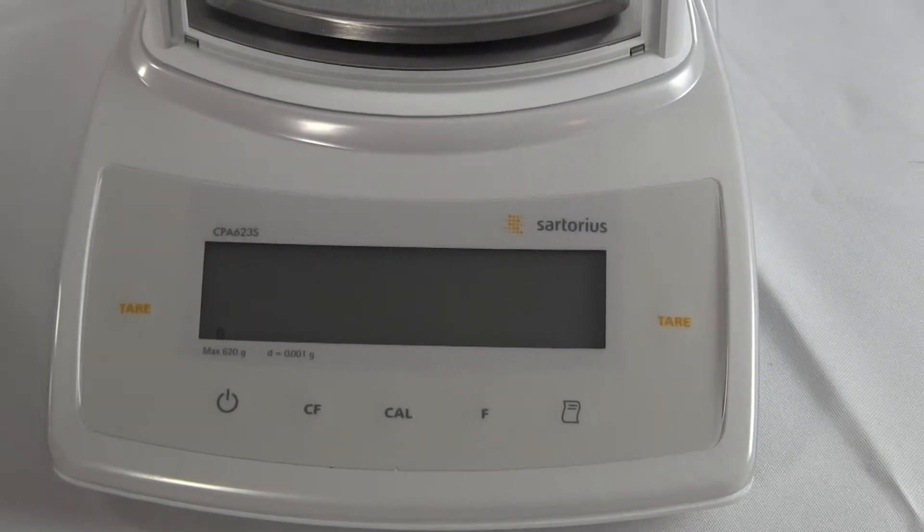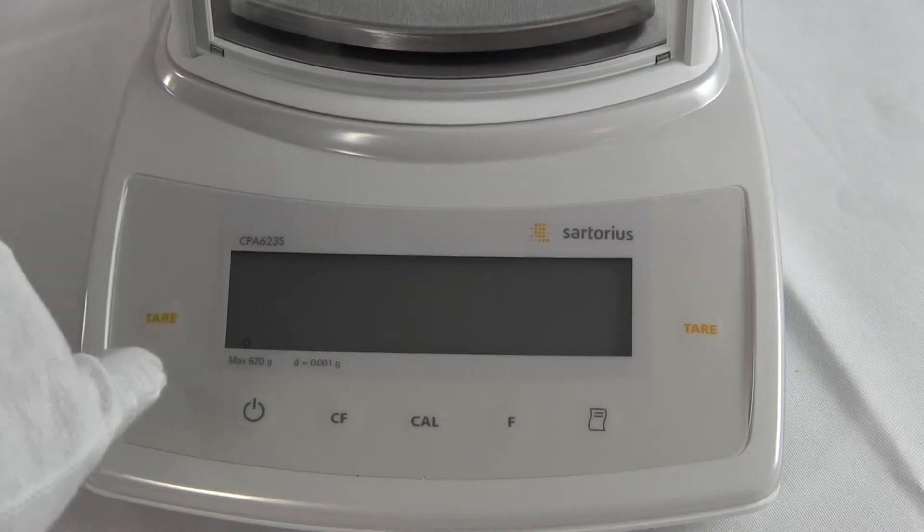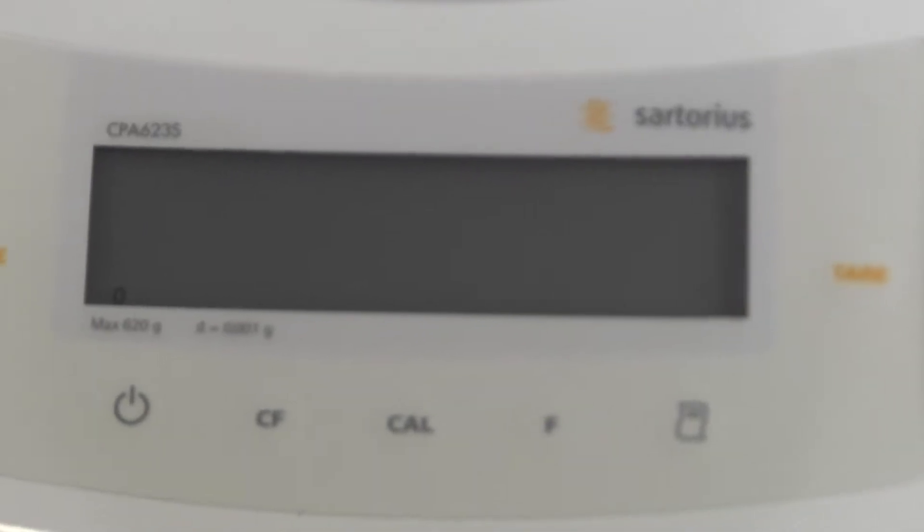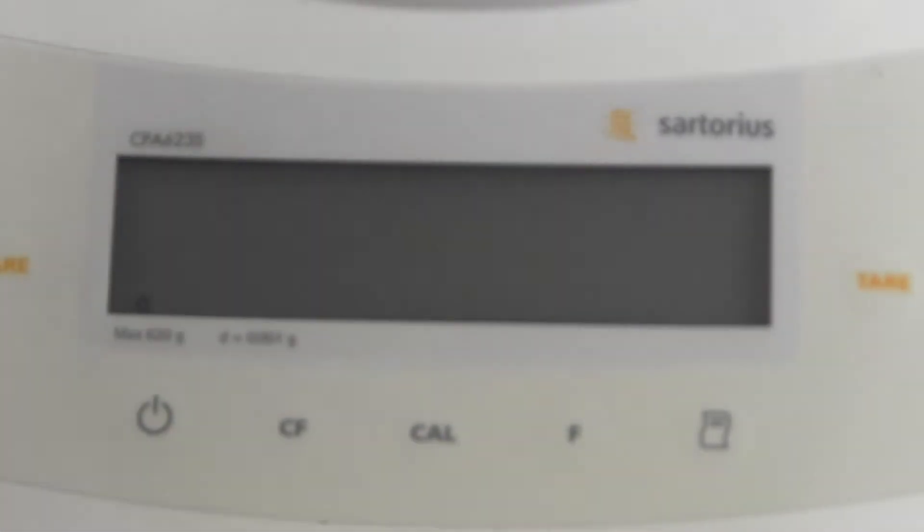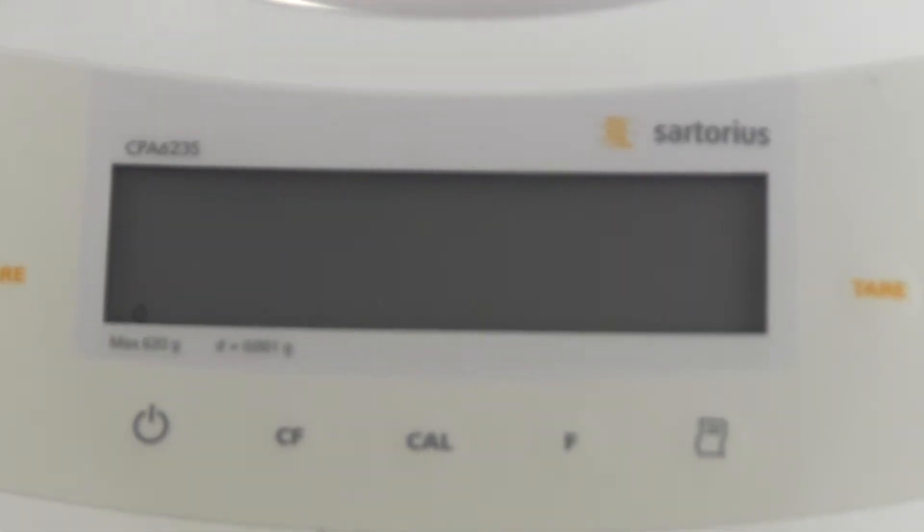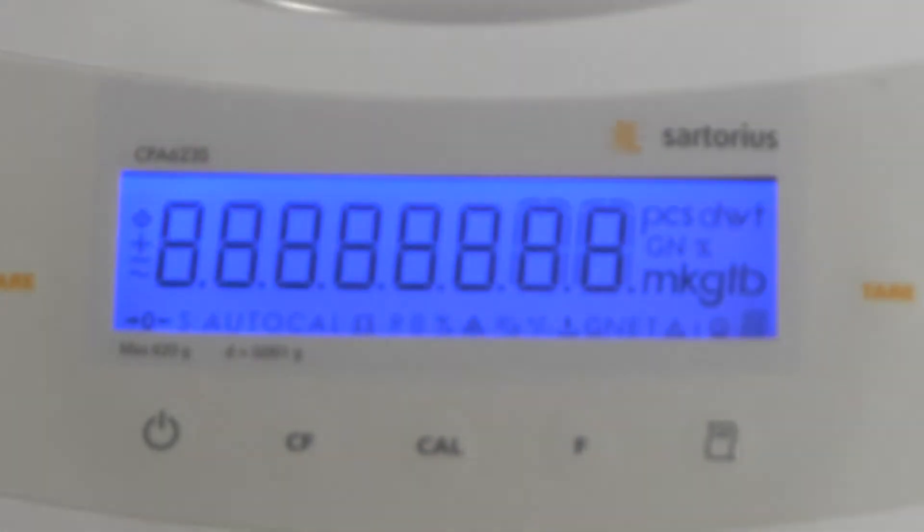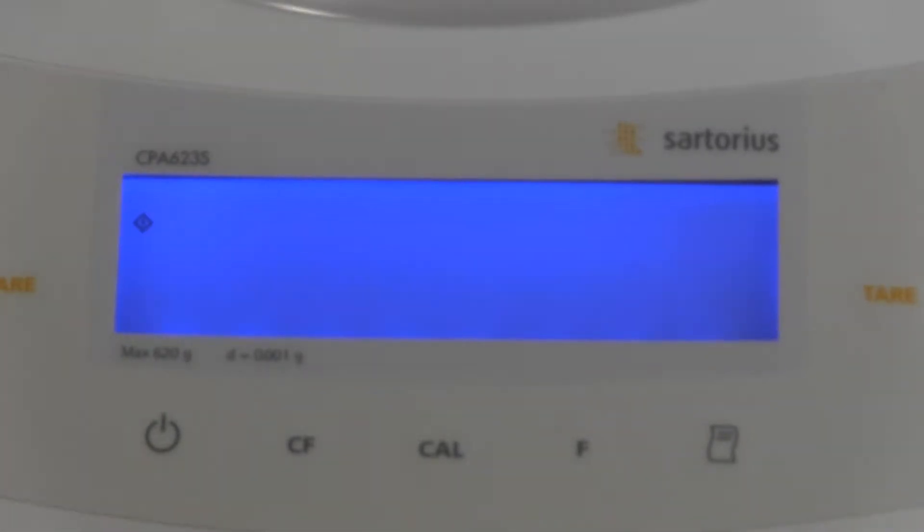So I just turned off the balance. You'll notice in the lower left-hand corner, there's a circle here. That circle means that the balance is receiving power. You always want to keep your balance plugged in because balances are sensitive to temperature and warm-up times. Before calibrating any balance, you really should have it plugged in for 30 minutes. So that little circle in the lower left-hand corner tells us that the balance is powered up. When we press the button to turn it on, all the numbers illuminate, and then it goes right to zero.